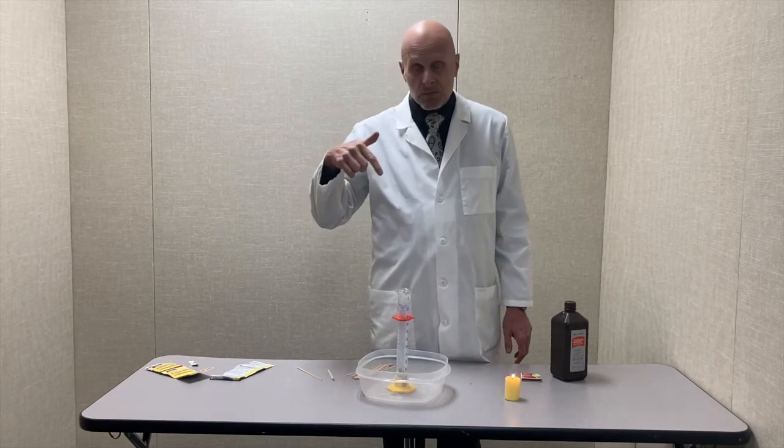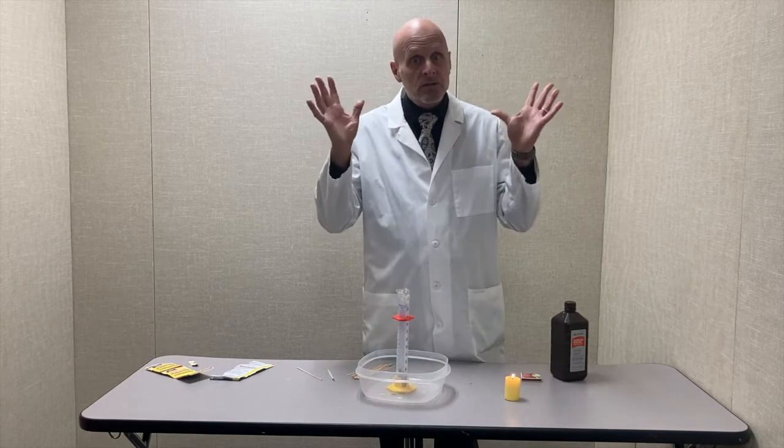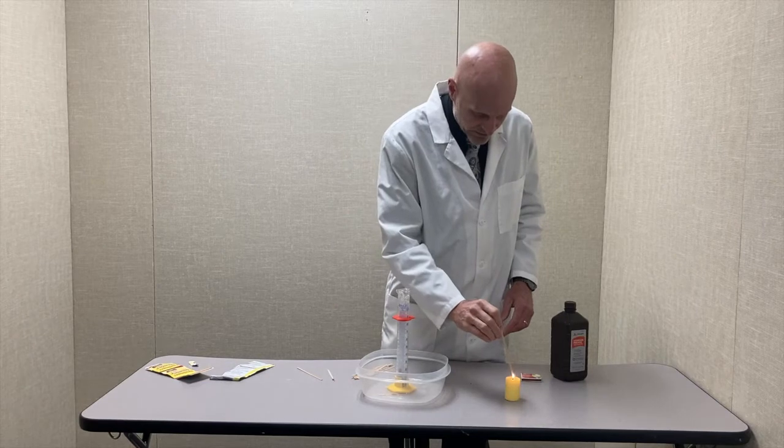So when I put in the wooden splint that's glowing on the end, there's so much oxygen that that ember can burst into flames. And notice that it's a white flame that's very bright because it's burning pure oxygen.